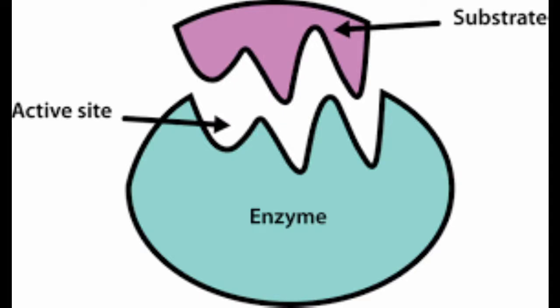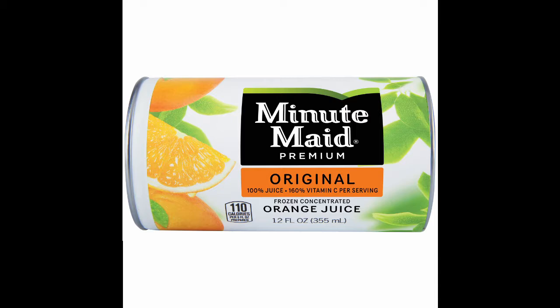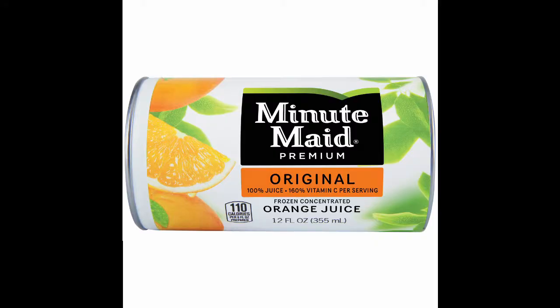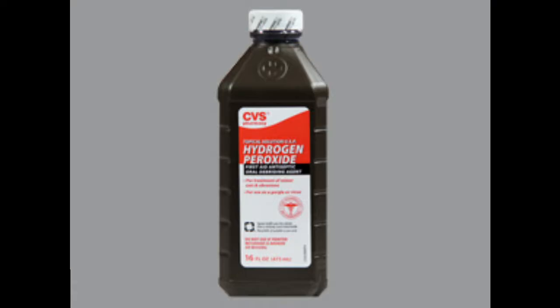Enzymes are essential biological molecules which are involved in chemical reactions within the cell. Many factors can affect the activity of these enzymes, such as temperature, pH, enzyme concentration, substrate concentration, and the presence of inhibitors or activators. This lab looked into how substrate concentration affected the activity of enzymes, specifically the rate at which catalase catalyzes the decomposition of varying hydrogen peroxide concentrations.